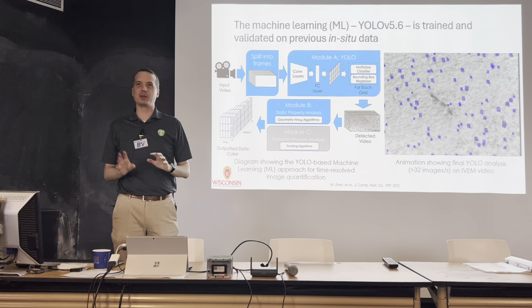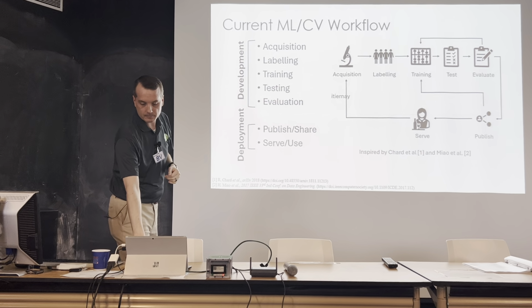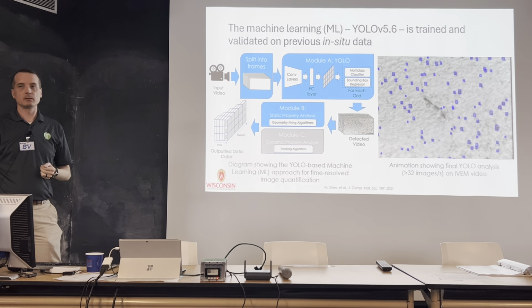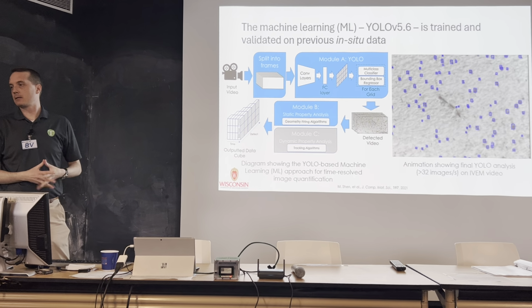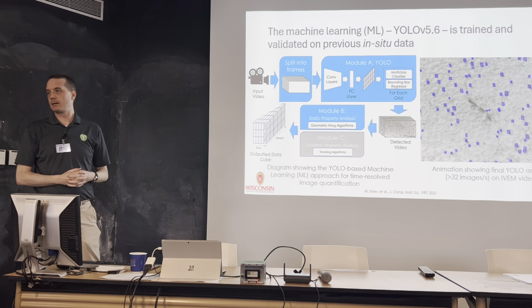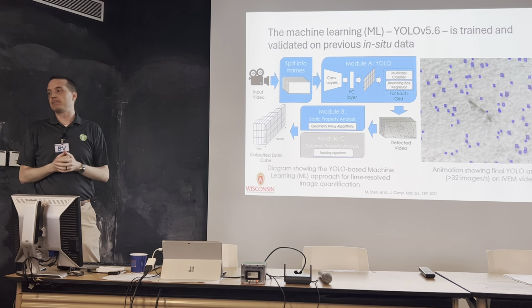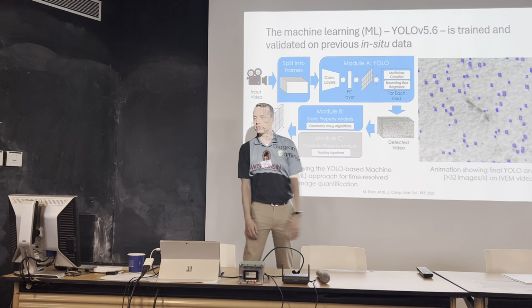I know everybody has a different definition of real time, but real time for the microscopist: was the speed it was being done the same speed that the data was coming in? It's about 30 frames a second. He's asking about the interpretation. So you ran this on a video, but the number of seconds it took to do the analysis, is that the number of seconds the data was collected for? No, it was like a time-lapse video, because it was an in situ TEM. I think this one was probably once a minute as well. Ah, okay. I don't know the exact specifics on there. It is in this paper though.